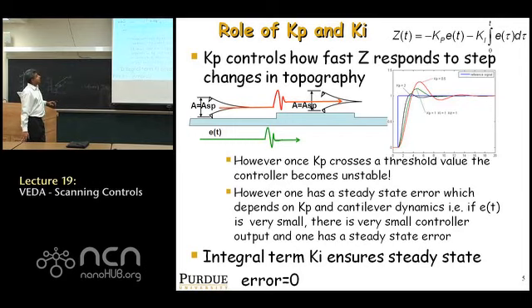The second term looks at the accumulated error signal in the last, let's say, time constant of the lock-in amplifier. What's the error signal in that, and then it actuates accordingly. So here's what's going to happen.